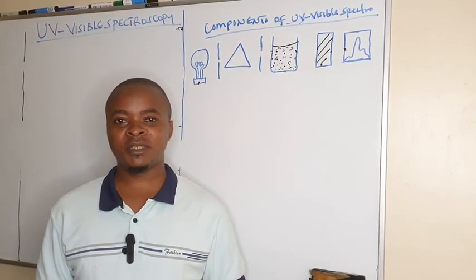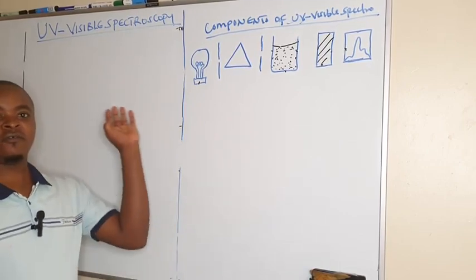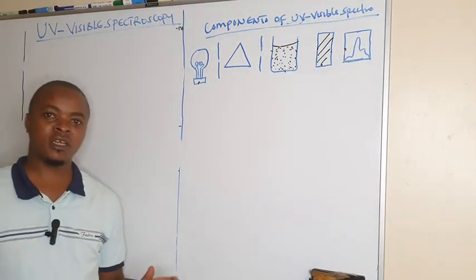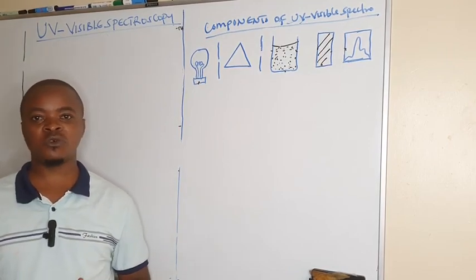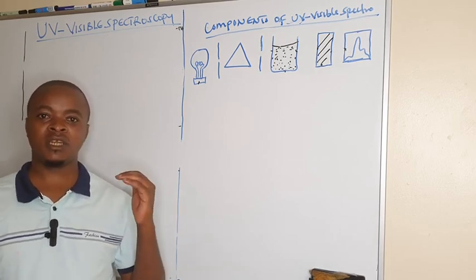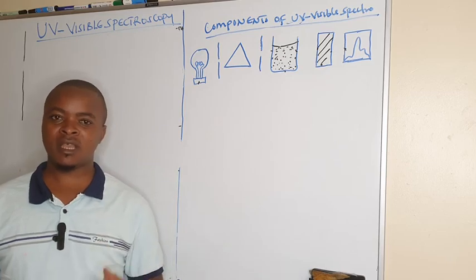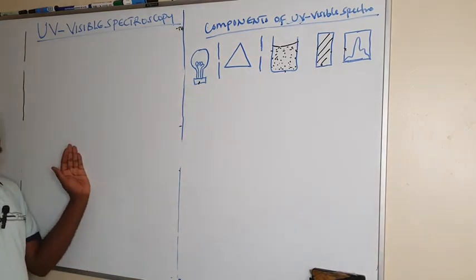Today's topic at Medical Sciences, we are looking at ultraviolet visible spectroscopy, which we are employing in pharmaceutical chemistry to determine and quantify the presence of molecules within drugs, within drug formulation. We can use it for accurate quantification. And also, we can determine the saturation and the bonding within these components.